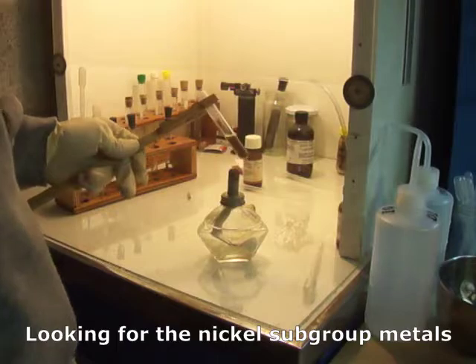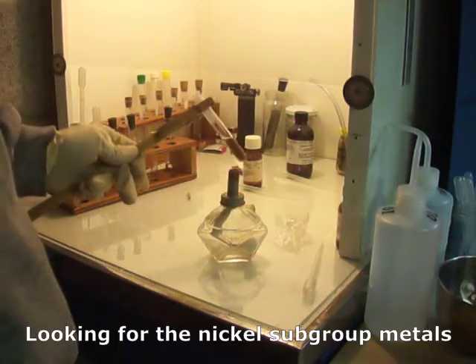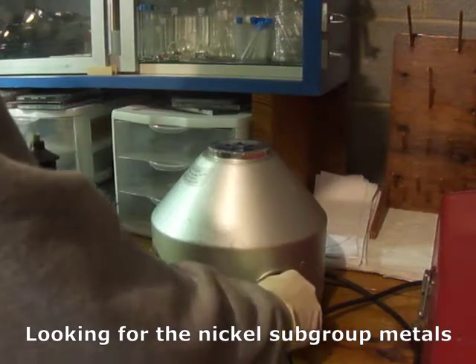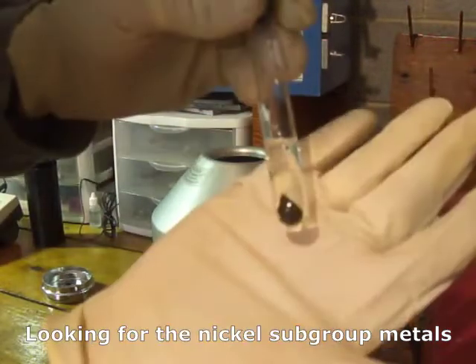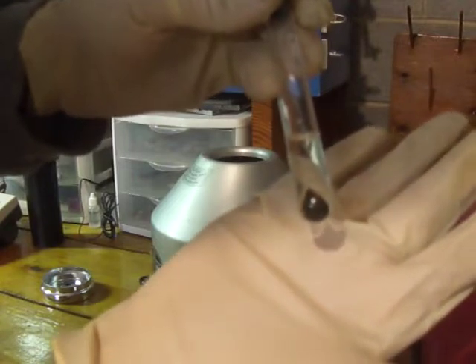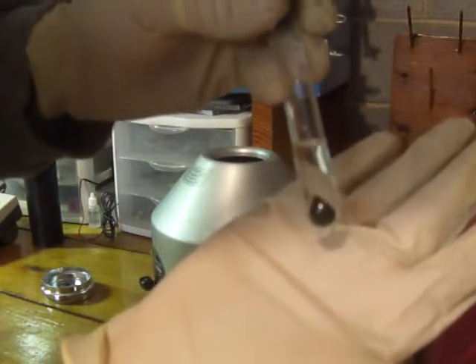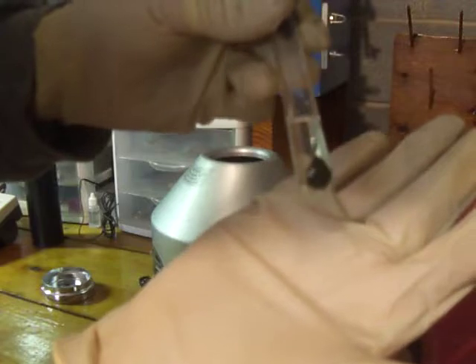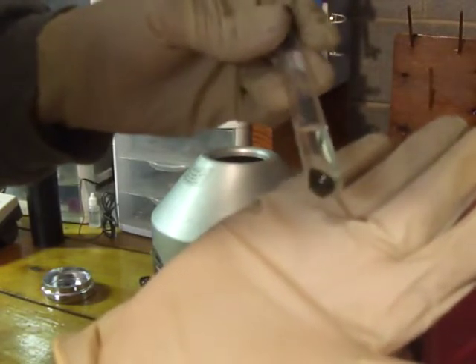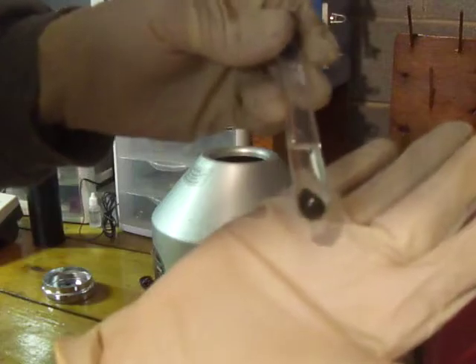Alright, we have a nice precipitate that is formed, so we definitely have something from the nickel group. So there's our precipitate. We're down to 4 cations: nickel, iron, manganese, or cobalt. Notice the black color. I know the manganese oxide is a black color. So we'll see what we get.